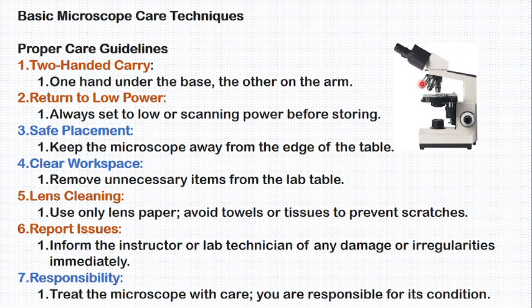And then remember to use only lens paper, the paper designed only to clean a microscope, not your own paper or other things. So report issues and take it as your responsibility.